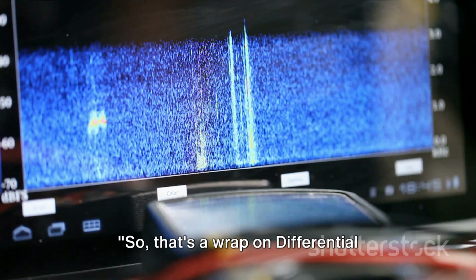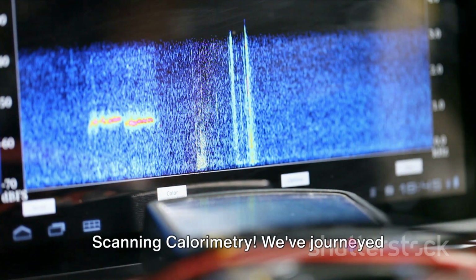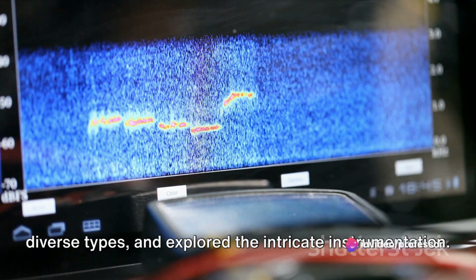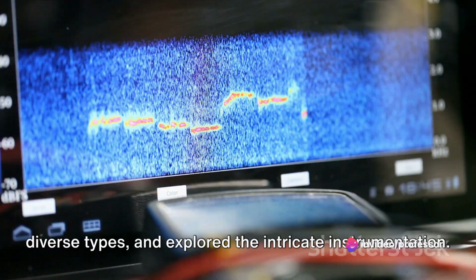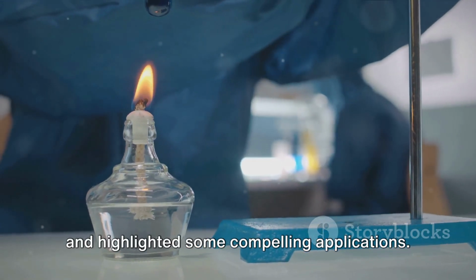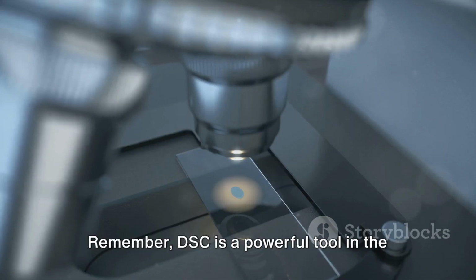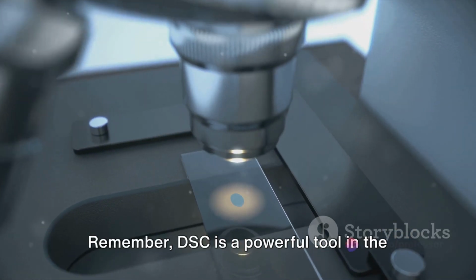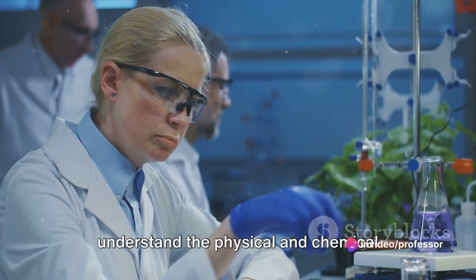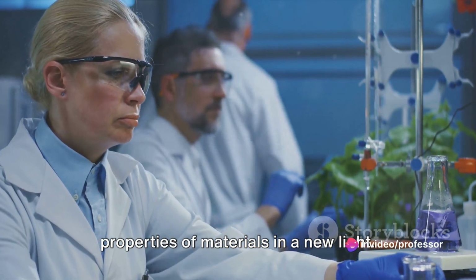So, that's a wrap on differential scanning calorimetry. We've journeyed through its definition, delved into its diverse types, and explored the intricate instrumentation. We've illuminated the governing principle and highlighted some compelling applications. Remember, DSC is a powerful tool in the realm of thermal analysis, enabling us to understand the physical and chemical properties of materials in a new light.